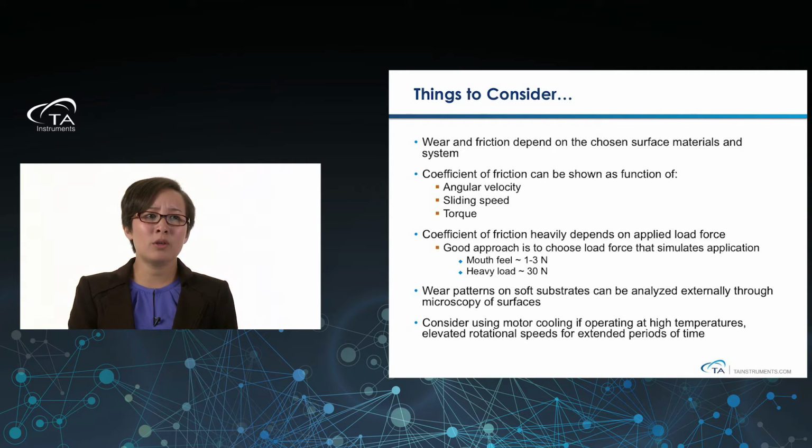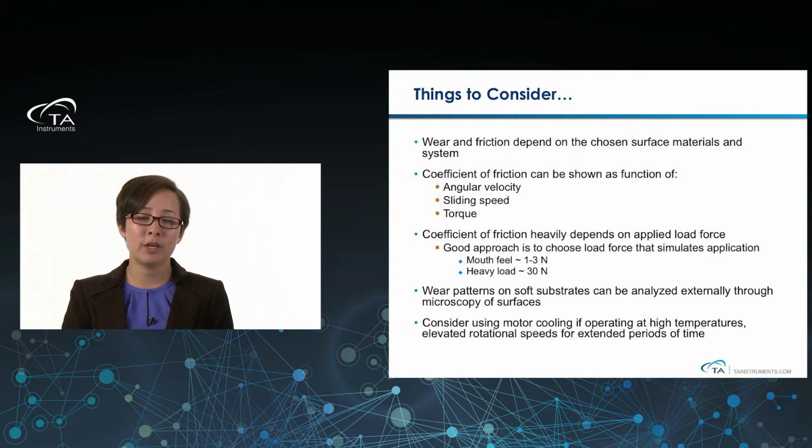A good approach is really to choose the load force that simulates the type of application that you're doing. For mouthfeel applications, we typically tend towards lower load forces, like 1 to 3 newtons. Or if it's something like greases and oils in engines, maybe we're looking at more of a heavy load, because those gears are really going to be compressed against one another. So these are all things to keep in mind.